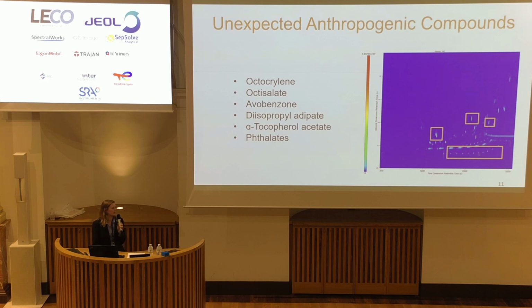So the ability to resolve these anthropogenic compounds from the endogenous fingerprint residue could be potentially useful in forensic investigations if this trace evidence is used as a forensic evidence source. I also want to point out that there is ample peak capacity and empty space in this chromatogram for finding unexpected compounds that wouldn't come from the clean fingerprints that we had in the lab.